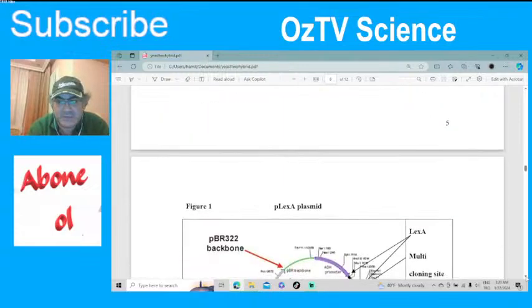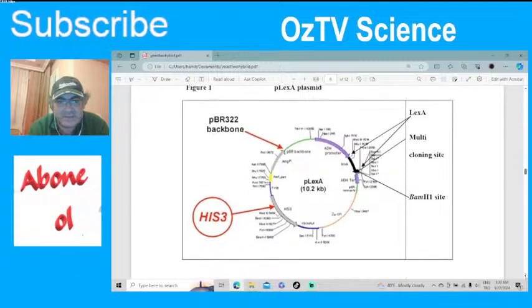So I'm just gonna read it. This is the structure. You should see the backbone. This is the general plasmid, pBR322. That's the ampicillin resistance, beta lactamase gene here. Histidine is inserted for yeast selection. It codes for the histidine amino acid, to make the cells prototroph.